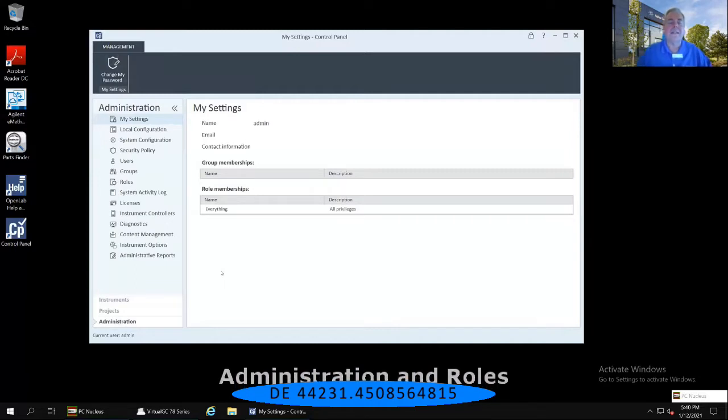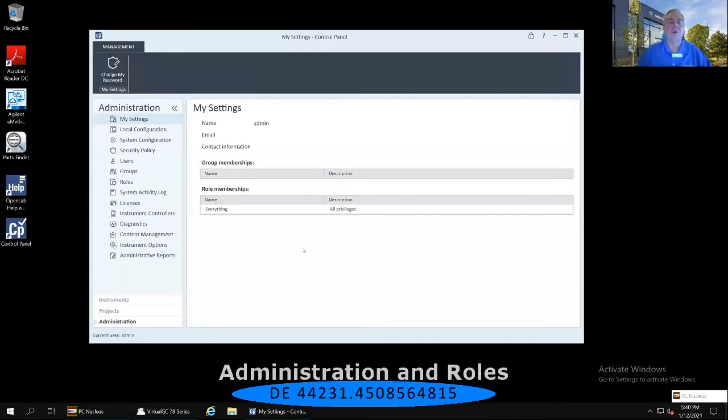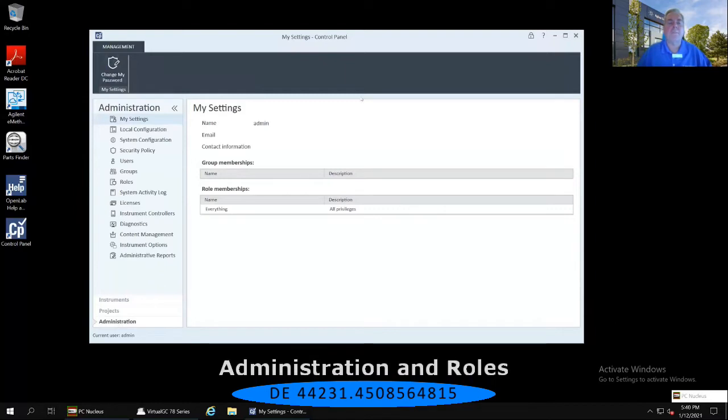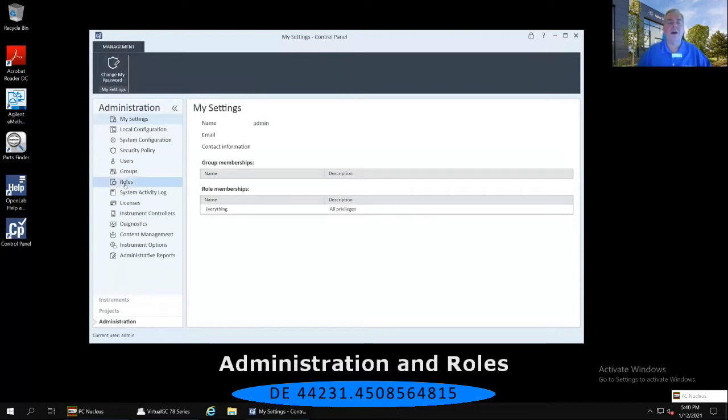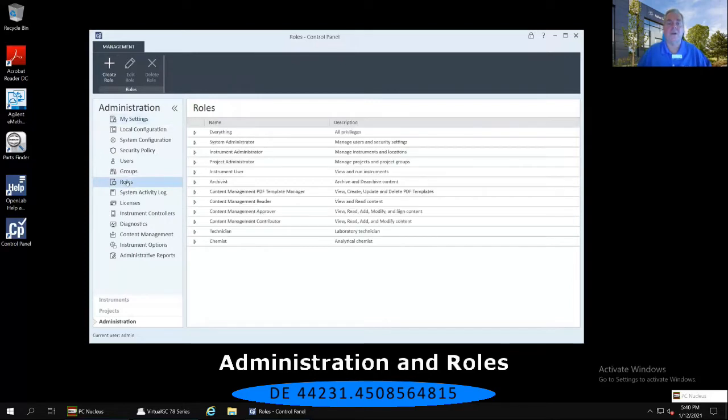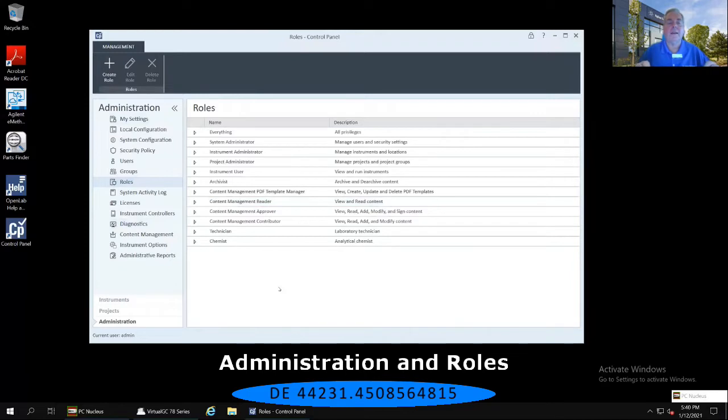For instance, if I would like to look at, let's say, my roles here, go down to the roles on the left-hand side. This is the definitions of what can be done within the software.